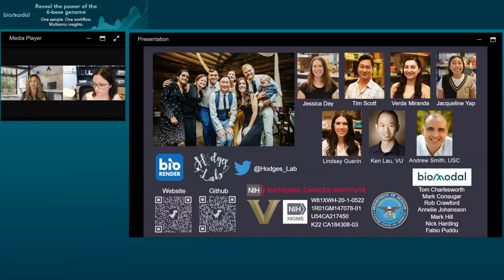So, Dr. Hodges, we have so many great questions already coming in, so I'm just going to dive right in. Starting with this one: what is the major difference between whole genome bisulfite sequencing and Biomodal sequencing?